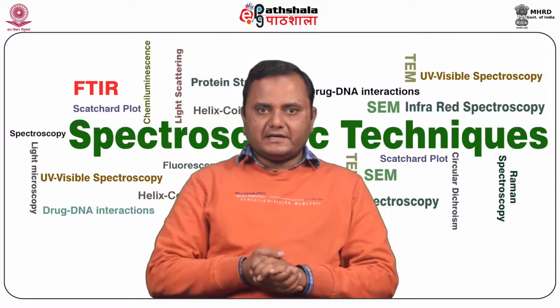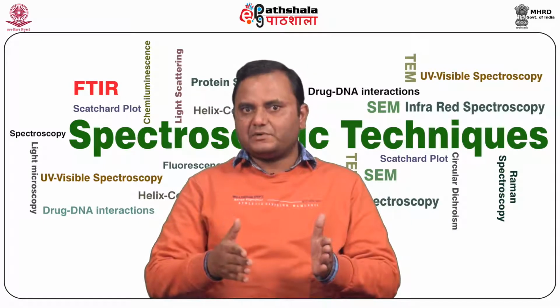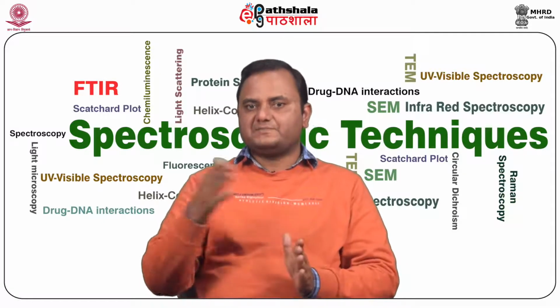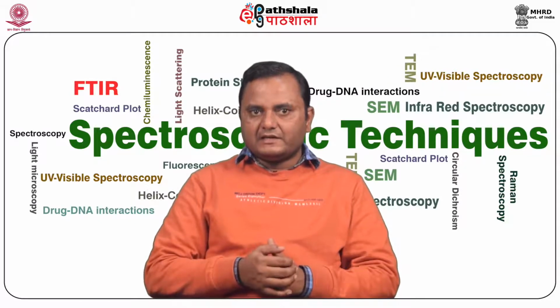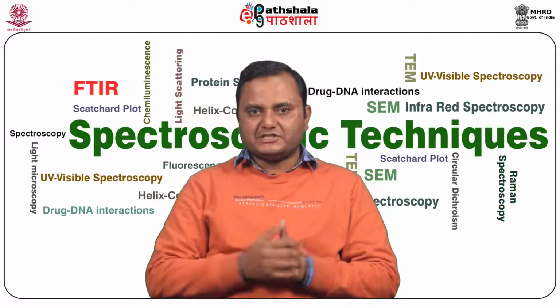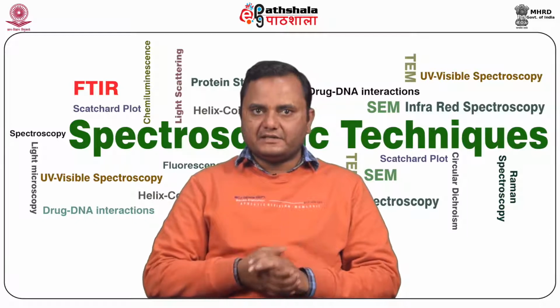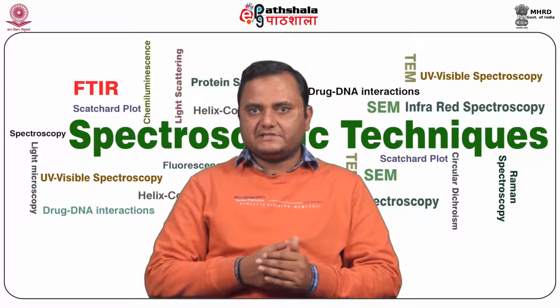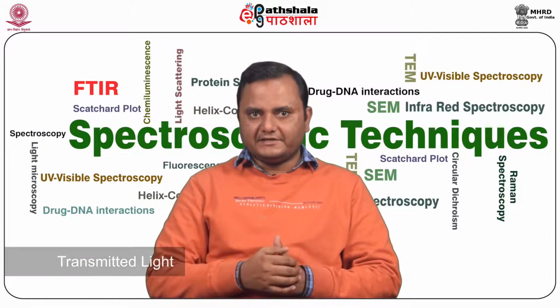CD is plotted as the extinction coefficient difference, left minus right polarized light, or as ellipticity. That's represented as delta epsilon with respect to the wavelength and expressed in terms of alpha or phi. Alpha is therefore the angle between the initial plane of polarization and the major axis of the ellipse of the resultant transmitted light. The quantity phi is defined such that tan phi is the ratio of the minor and major axis of the ellipse of the transmitted light.